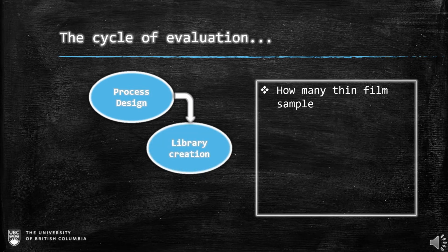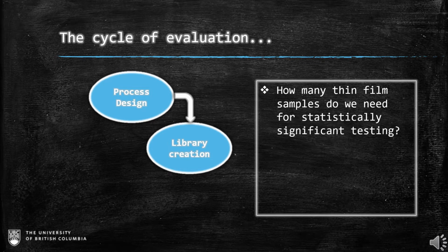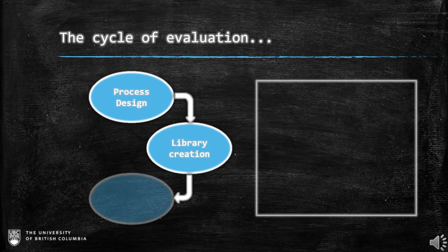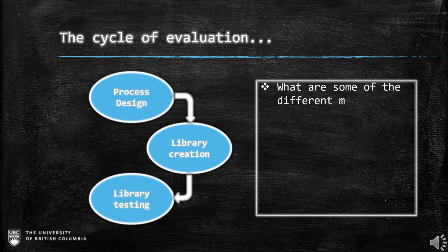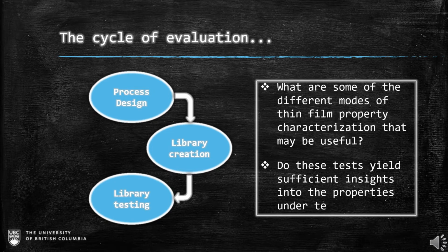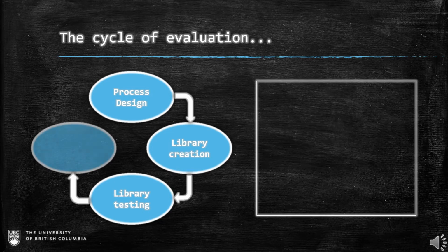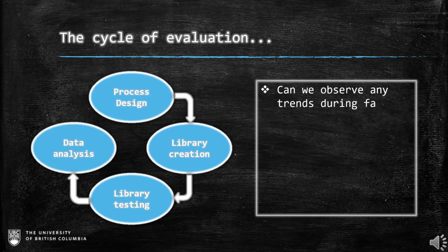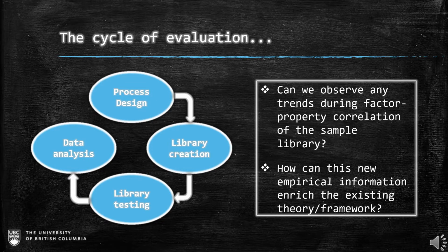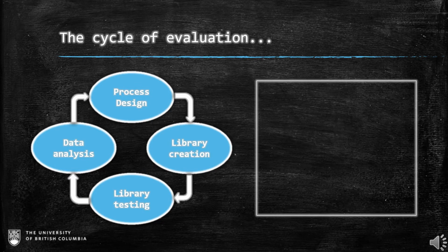This is followed by material formulation at variable compositions, setting library size specifications, and subsequent library preparation, which is achieved using our combinatorial printing platform. Next, we characterize the prepared thin film library to obtain qualitative understanding as well as quantifiable insights into the specific thin film properties being probed. And finally, the conclusions are analyzed to provide direction to future printing iterations and possibly improve upon existing models. In the rest of this video, we take a closer look at these steps and what each of them involve.